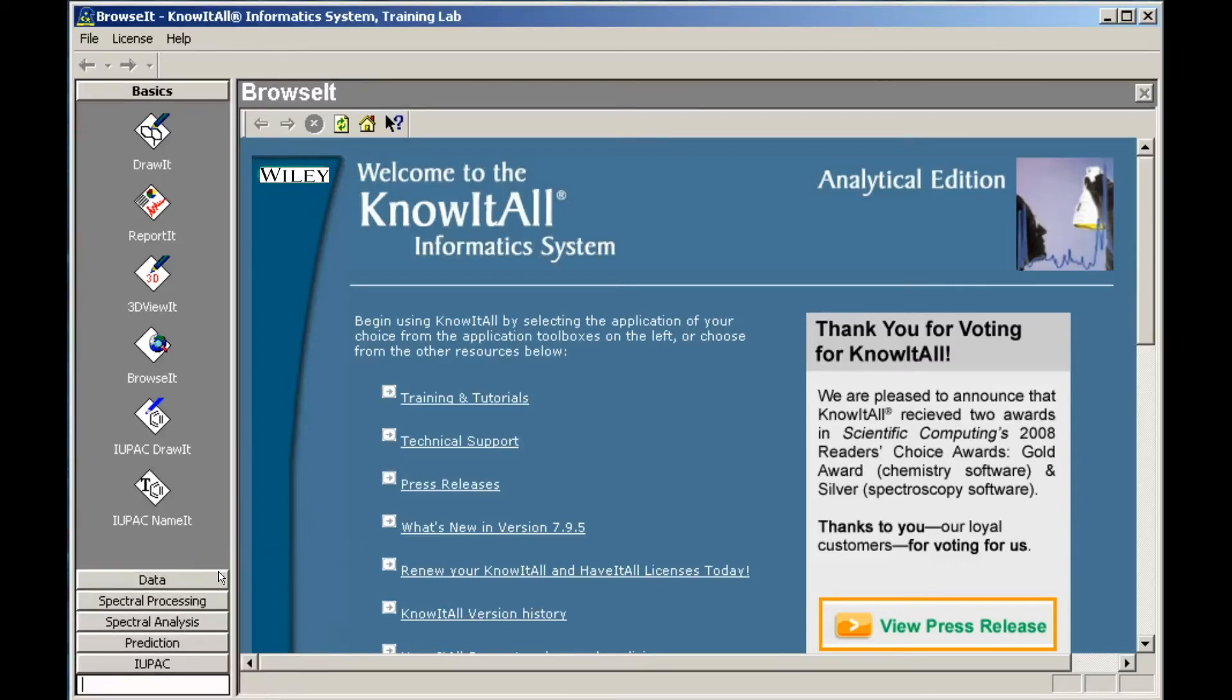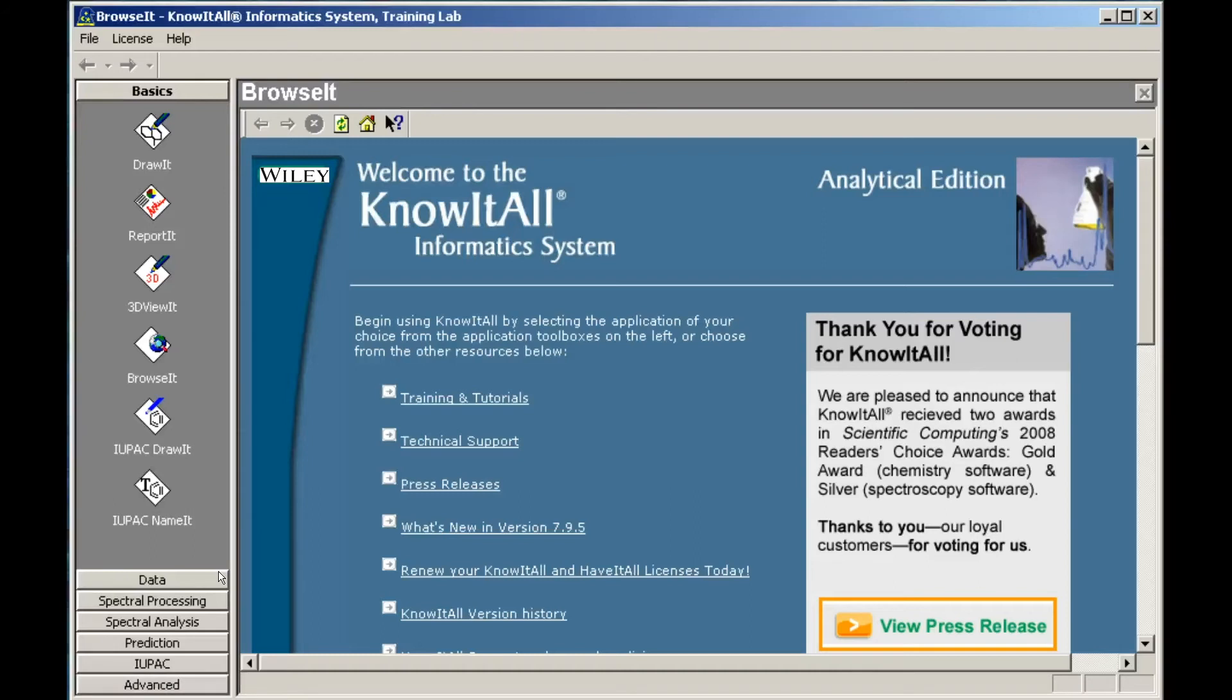A new toolbox is added at the bottom of the toolbox area, and the cursor is placed in the toolbox's title bar, ready for typing. Type in the new toolbox's name, then click to open the new toolbox.